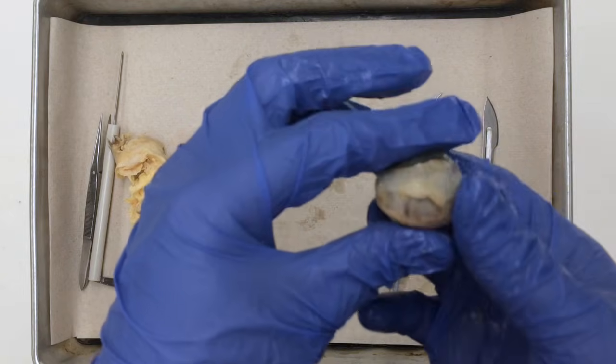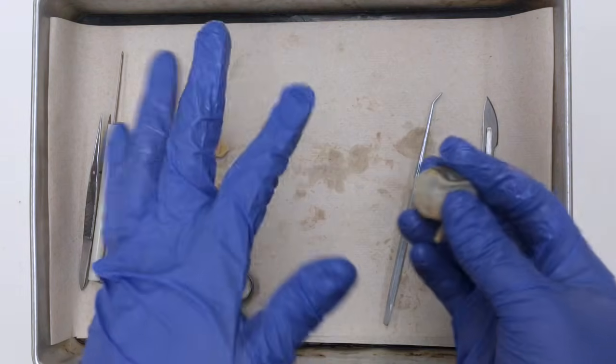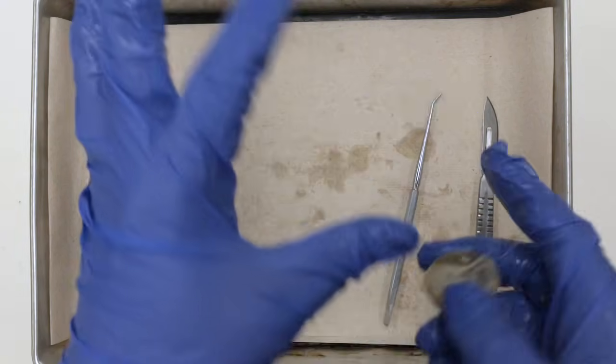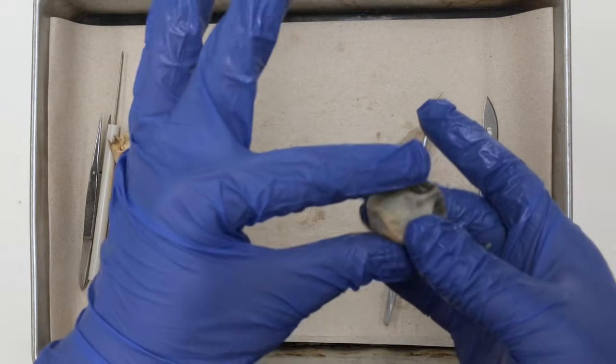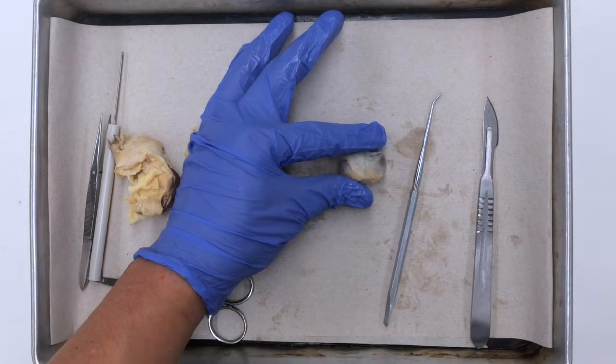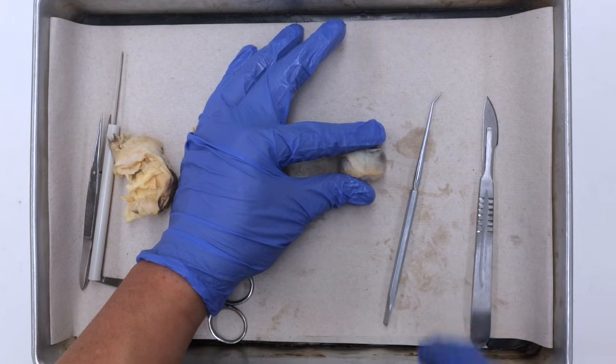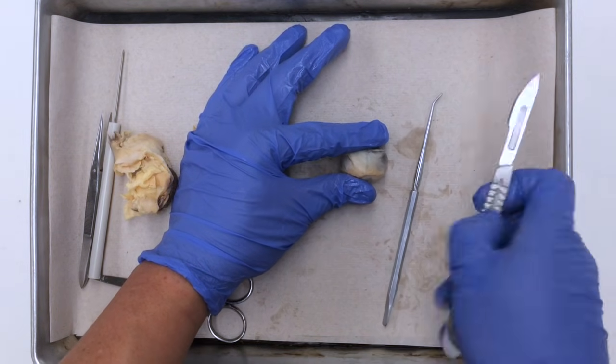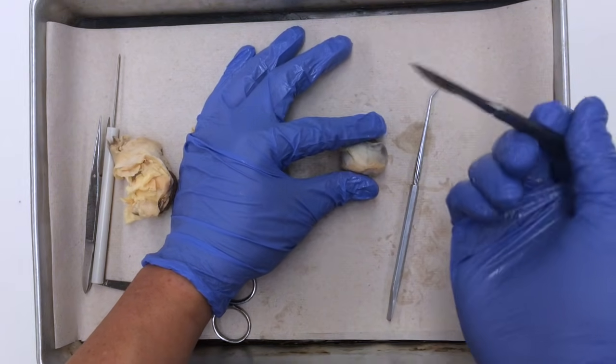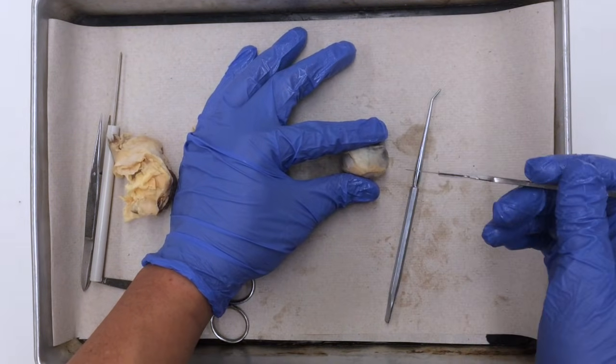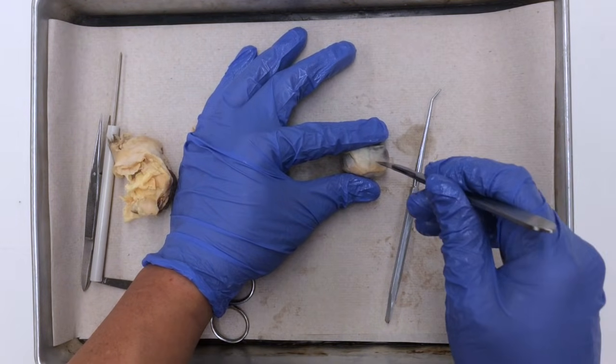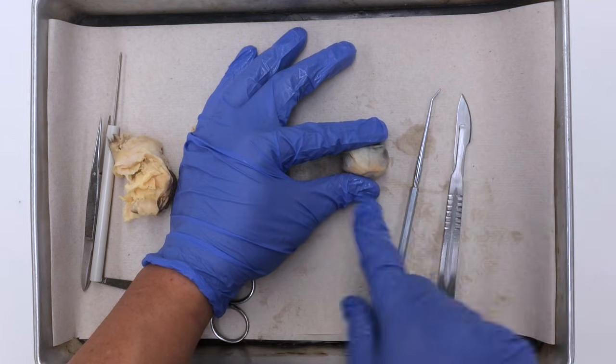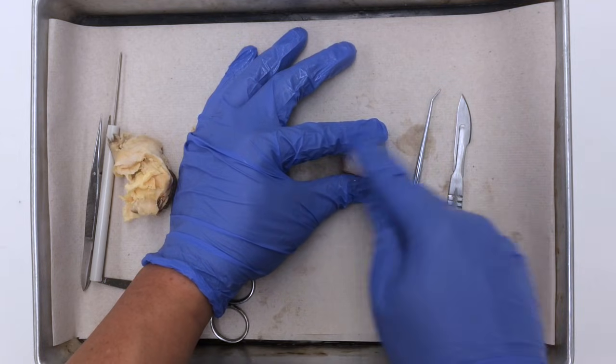I'm going to place the eyeball up against my thumb and my index finger, and I'm going to hold it still against the dissecting tray. Using the scalpel, I'm going to make an incision, and then I'm going to use my pair of scissors to trim around the eyeball.